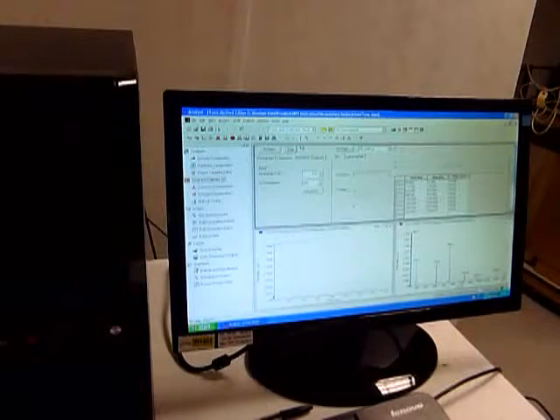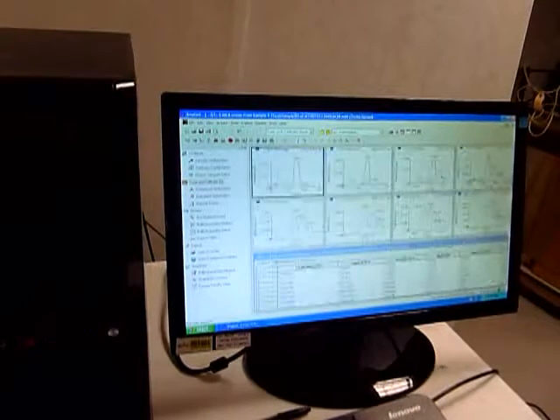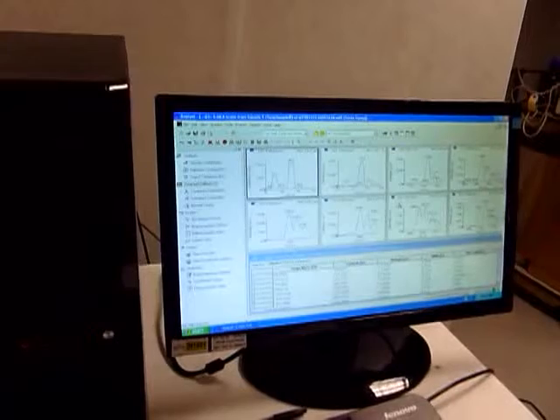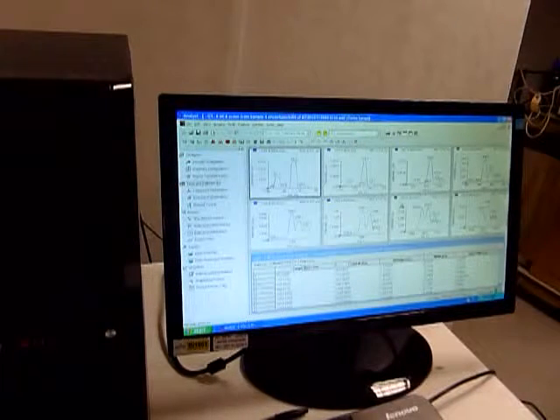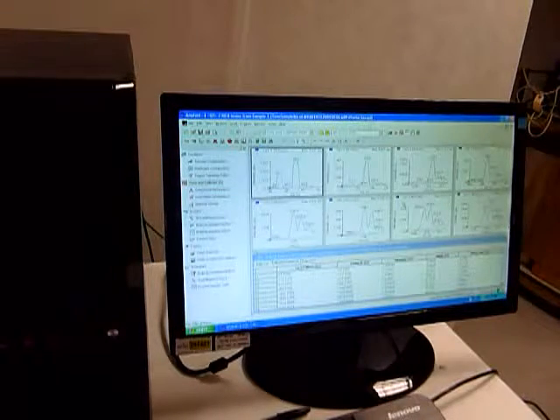We can review the data while it's running. We right click on this window, open file, and we see our eight peaks there. As you can see, you've got nice peaks, nice isotopic ratios, well resolved, and good sensitivity in all modes.